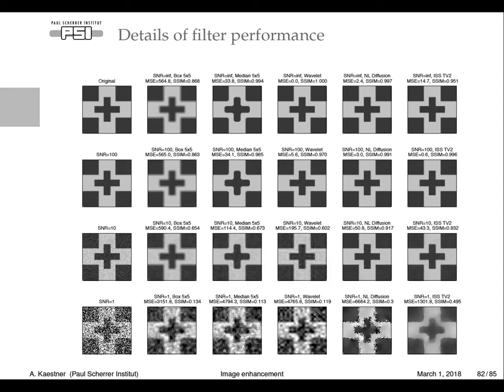The diffusion filter, due to the implementation around the edges, has this edge barrier, and I must admit there are better implementations of the diffusion filter, which also look along the edges and filter them too. But in this case, I had one that didn't take care of that.